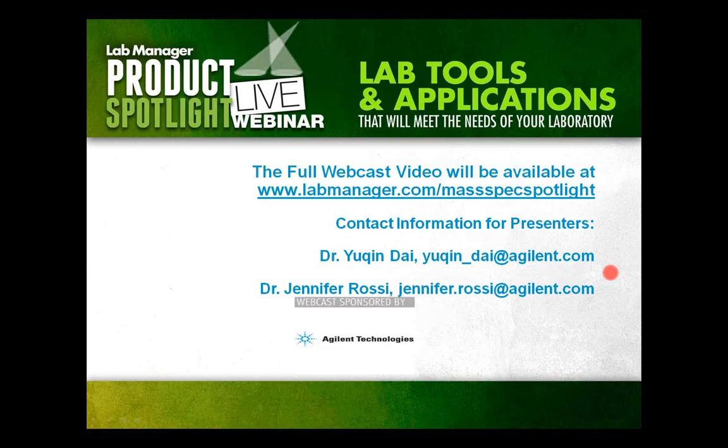So this is Jen. It's very different. Yuqin talked about liquid chromatography, and what I was talking about is SPE. And they're both sample preparation methods. With chromatography, obviously, there's much more of a separation of the sample, and SPE is much quicker.